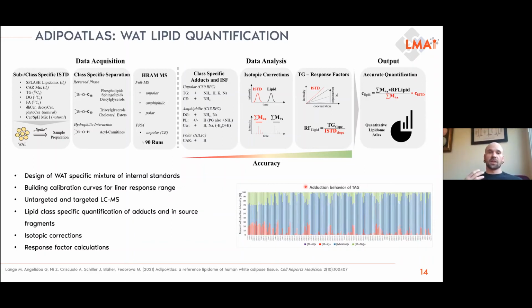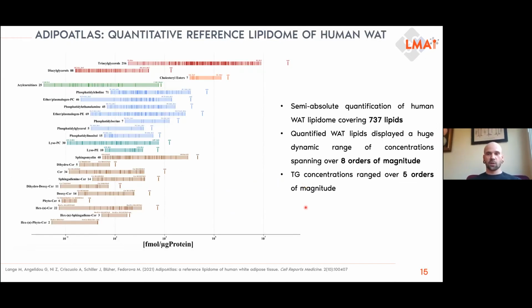Additionally, we performed some isotopic corrections, and I also developed some response factors for triglycerides that I'm not going into detail with. But the main outcome here is very high accuracy of the quantification, very high confidence of the identification. So we are very sure about what we actually measured here. And so this is what we came out with.